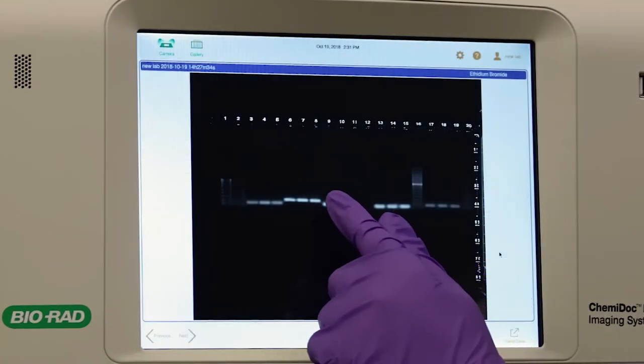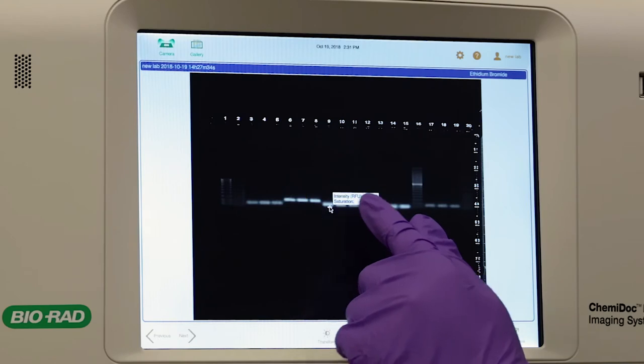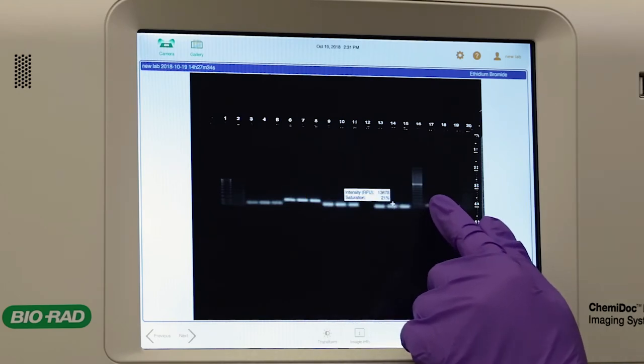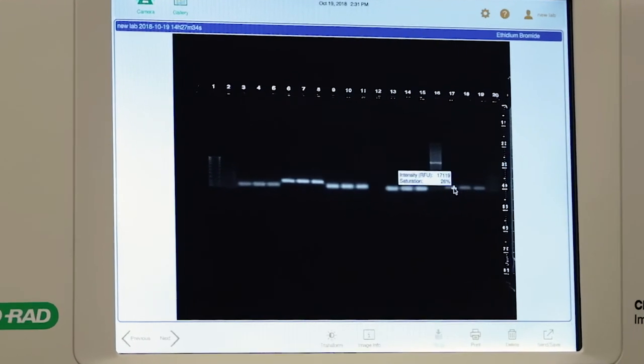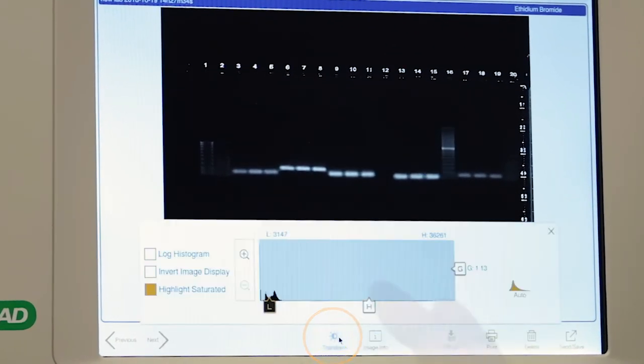For a quick assessment of the band intensities, tap each band and the relative fluorescence units as well as percent to saturation will appear. Tap the Transform icon in the lower toolbar.